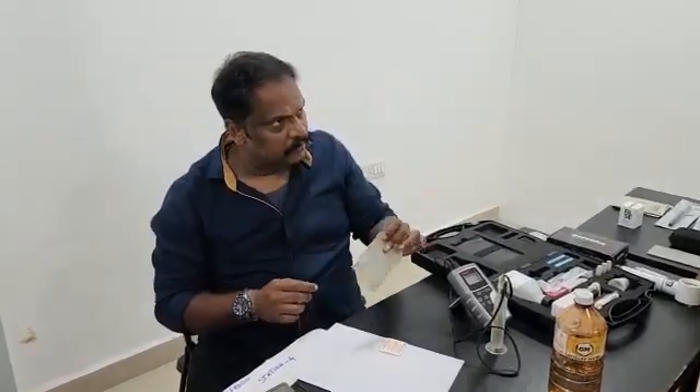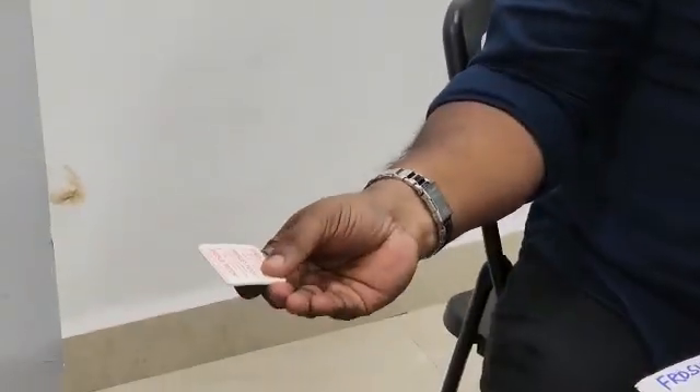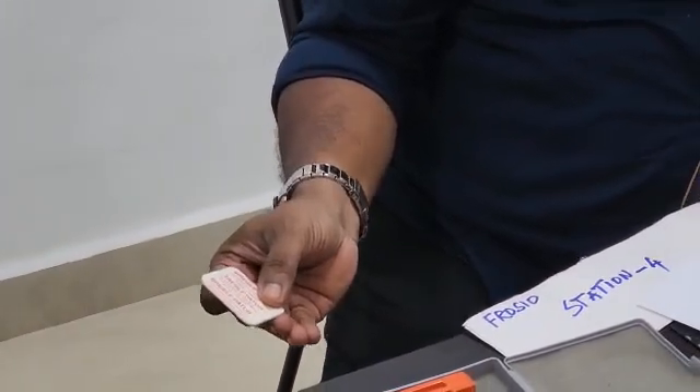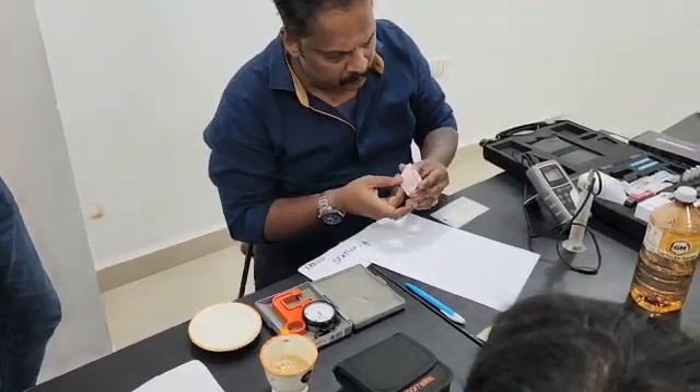Assuming this is the blasted plate, you should not touch it with your bare hands because your hands might contaminate the substrate. This is called a Bresle patch. Assuming this is your substrate to be checked for salt concentration.